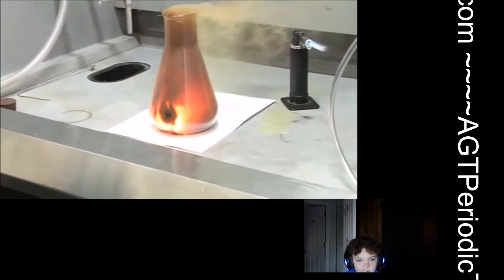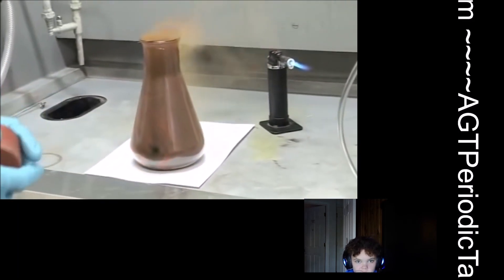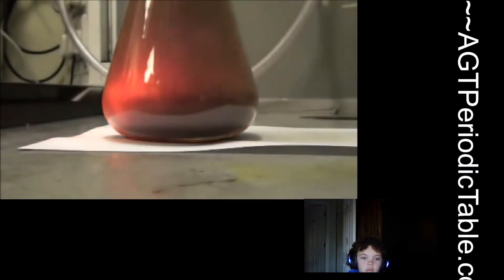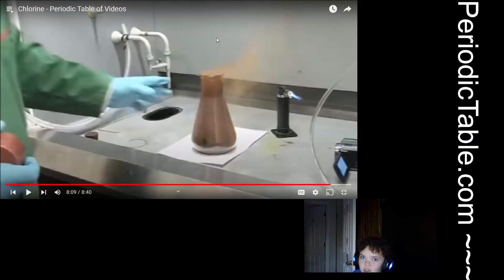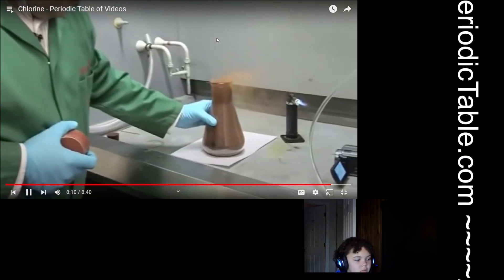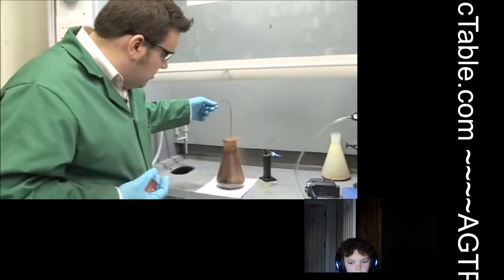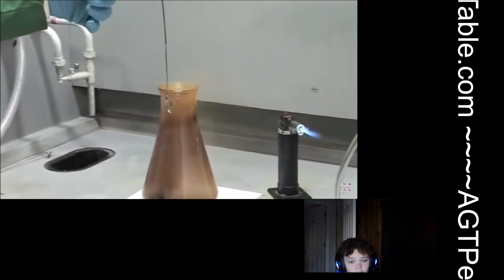So really rapid reaction there as the hot iron starts to react with the chlorine to form iron chloride. Very, very exothermic again. And I think, yes, this is very hot. We might have to move it off the paper. So what happens in all of these reactions is that the chlorine removes an electron from the metal to make the chloride ion, Cl-. And the chloride ion is perfectly innocuous. You can drink, you can eat chloride, whereas chlorine itself is very poisonous. So maybe what's actually in the pools is chloride rather than chlorine. It's warm. It's not too hot to touch. It's like picking up a mug of warm tea or warm coffee. But you can see, again, the products of the chemical reaction are precipitated out across the flask. And now if I remove the wire again, I can see that all of the iron has been consumed instantly. The moment that it got into that chlorine-rich flask, very, very rapid reaction. Very, very reactive with chlorine.